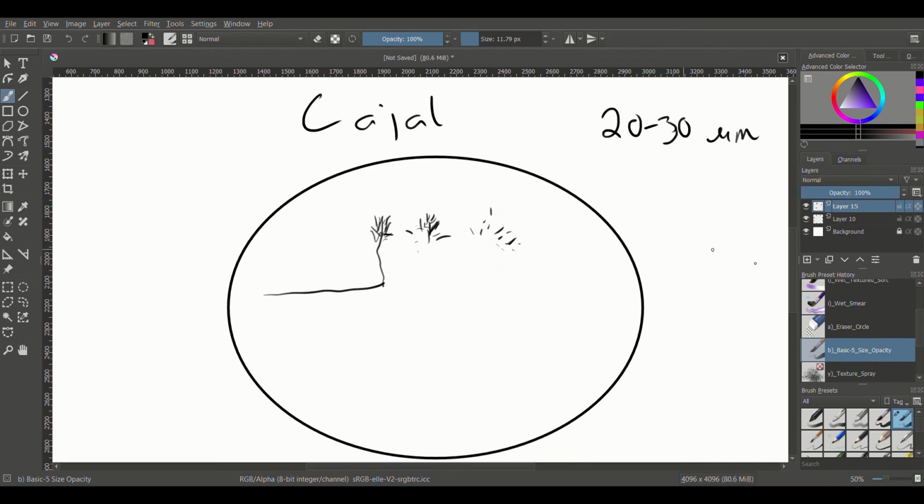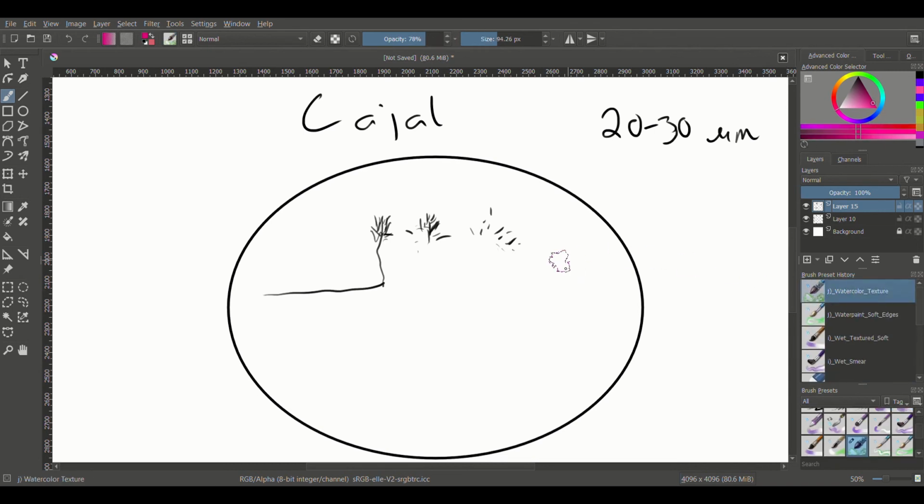And the background can be kind of a pink color, so purple to pink, as I understand. Once again, these things are not run very often in the labs where I have worked, and my guess is just because they've been replaced by IHCs for the most part. But yeah, you might see something like this. And so if you see that pink to purple background, and you're seeing some very, very dark lines that look like neurons and look like axons or astrocytes, and you're seeing those little projections, chances are that's a Cajal's gold sublimate.